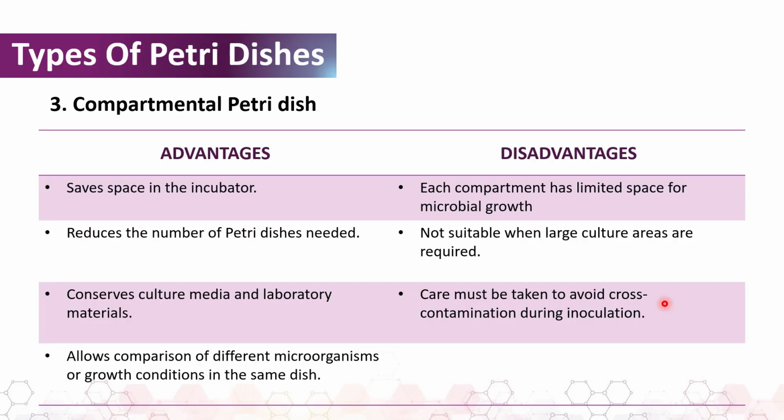Advantages and disadvantages of the compartmental Petri dish. So let's start by looking at the advantages. 1, it saves space in the incubator. 2, it reduces the number of Petri dishes needed. It also conserves culture media and laboratory materials. And finally, it allows comparison of different microorganisms or growth conditions in the same Petri dish.